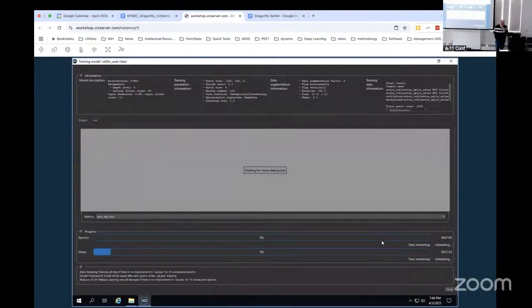Since we're giving it all of the old data, all the synthetic data plus the new real data, and we're really just trying to make it ignore things in the background, I've found that you really don't have to retrain it that long. Obviously it's slower because there's more patches, but if we just let that run for like 10 epochs, it will probably ignore everything other than the actin.